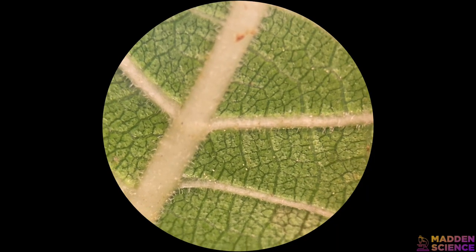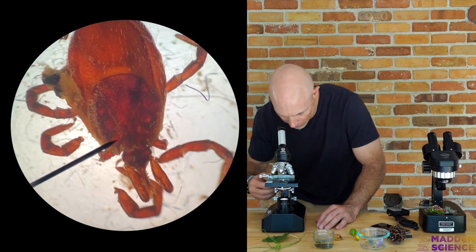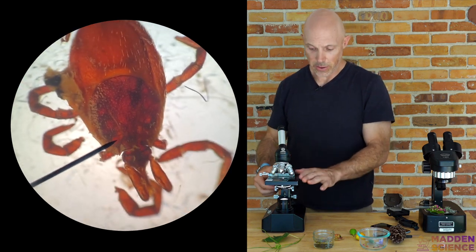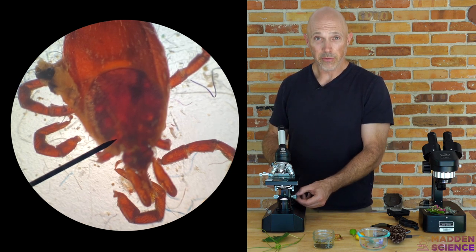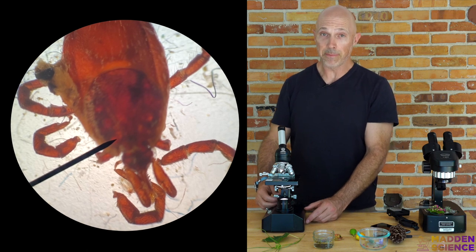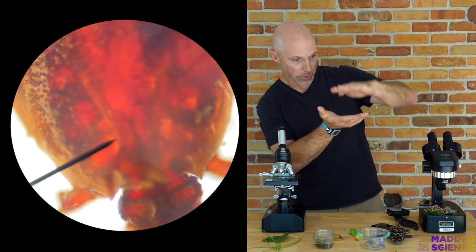You'll always want to start under the lowest magnification — basically, farthest away and least close in. This gives you the lowest magnification but the greatest range or breadth of view. So start on the lowest, put your tick on the stage, and you can see the full specimen. Begin by moving the stage closer to you. Once you have it under the best focus you can get with the large knob or coarse adjustment, you'll do something finer with the fine adjustment — this gets it even more dialed in. Everything you look at is 3D, so you can focus on different layers; the bigger the thing you're looking at, the more layers you can focus on.